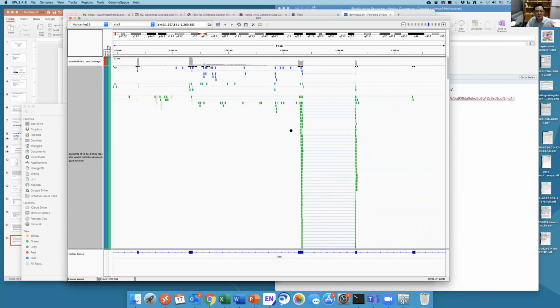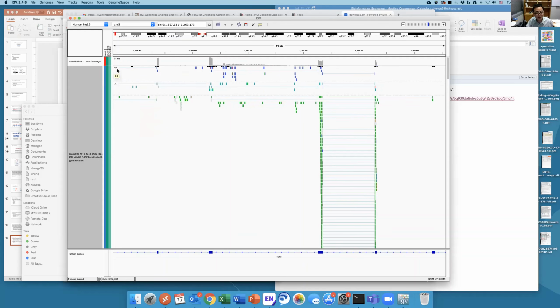If I zoom out, you can see on the left, IGV shows you this is RR, this is LL, okay? And this, without LL or RR, indicates these are the normal reads. So at least based on the read orientation and insert size, IGV does not think these reads are abnormal. But the RR and LL are the abnormal reads that were highlighted by IGV.